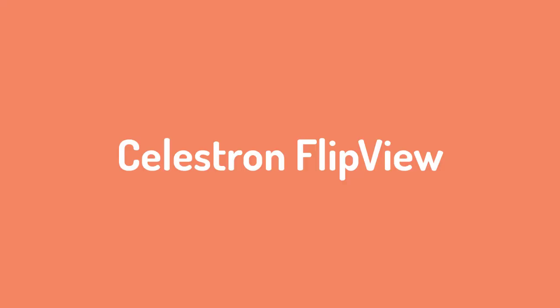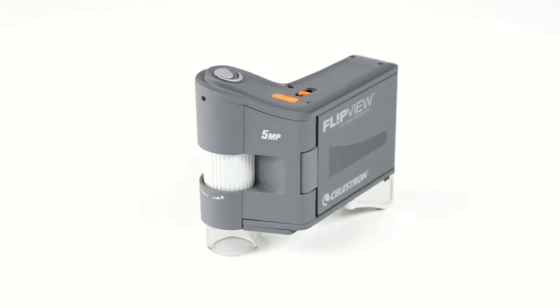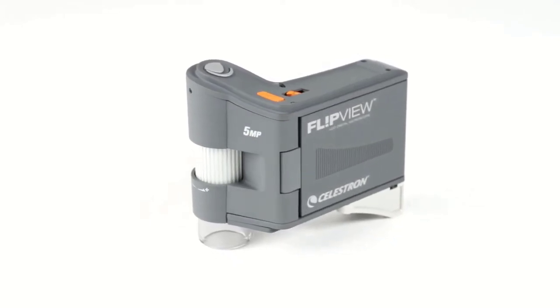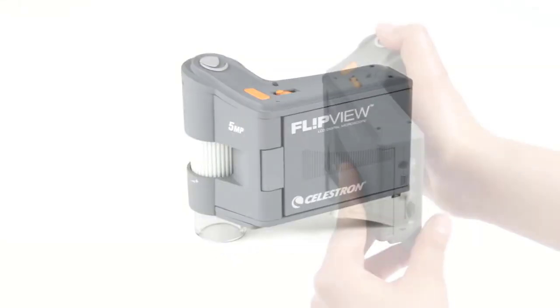Number 3. Celestron Flip View. This unusual design rethinks the traditional microscope, so instead of looking at your miniature subjects through an eyepiece, you view them using a flip-out LCD screen.